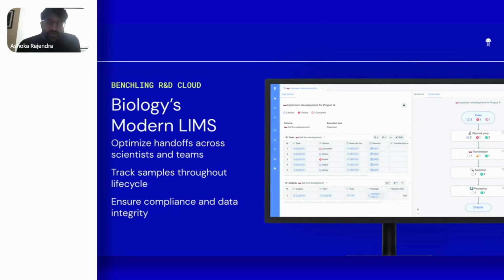And with that, I'm excited to share with you a new category functionality within Benchling, which is the modern LIMS for biology. This modern, connected, and adaptable solution redefines processes traditionally tracked in LIMS. Teams can design, test, and produce complex biomolecules in a unified collaborative effort. And unlike legacy LIMS, the Benchling R&D Cloud offers continual product innovation to keep pace with evolving processes and evolving science. Now, teams can manage complex multi-step and cross-functional processes within our workflow system, track data modifications in regulated environments, and trace samples directly within the Benchling notebook.